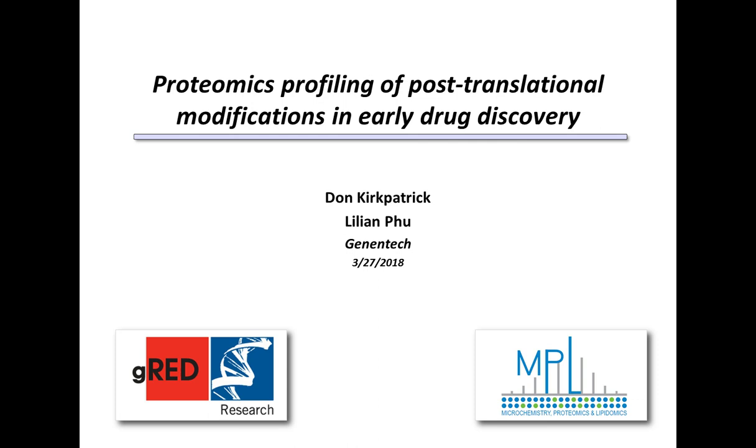I'll just add to that briefly that we also do a lot of label-free quant, and we've used a few different programs. We've used Progenesis. Skyline, which is a free piece of software, has worked well for us, and then I know a lot of users out there are using MaxQuant and the MaxQuant Studio to do their label-free quantification.